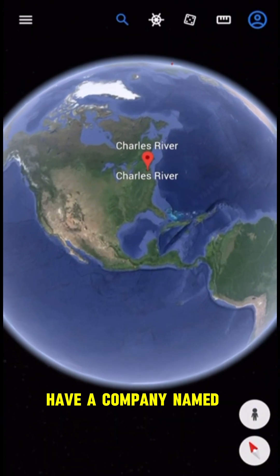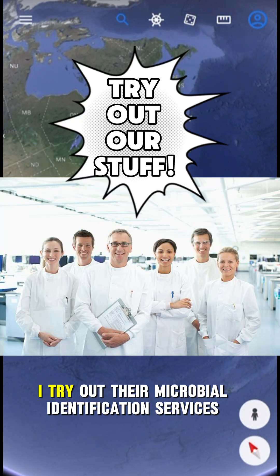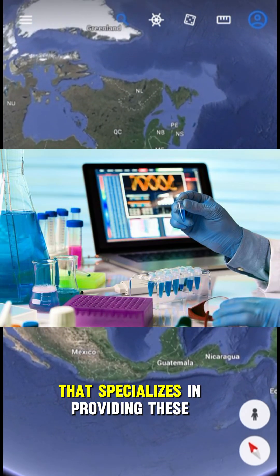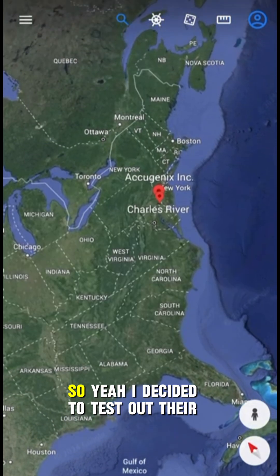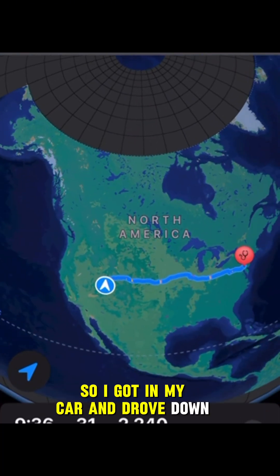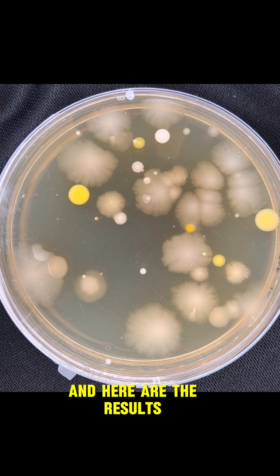I was fortunate enough to have a company named Acugenics, which is owned by Charles River, reach out suggesting I try out their microbial identification services. This is a company that specializes in providing these services, especially in clinical and industry settings. So I got in my car and drove down to the nearest FedEx, sent them those petri dishes, and here are the results.